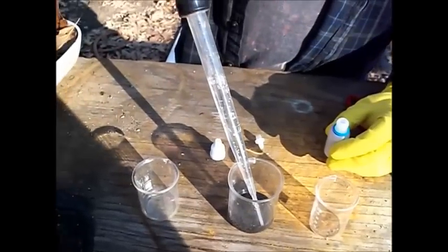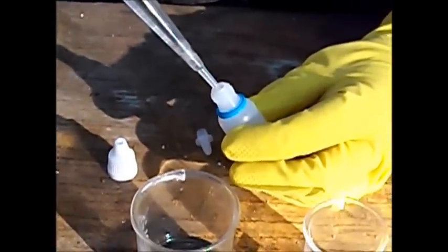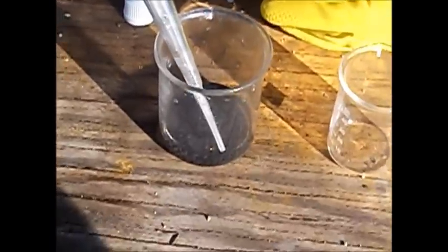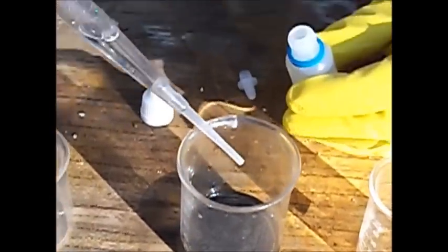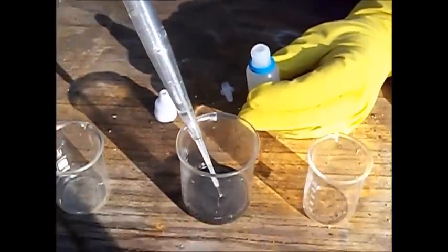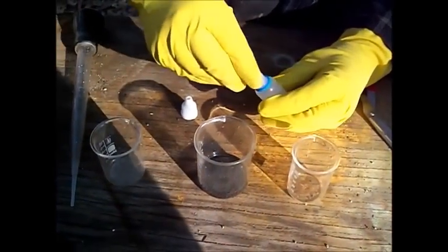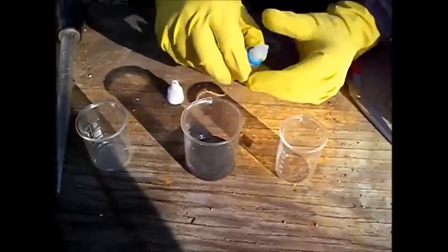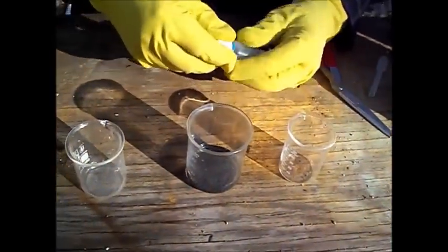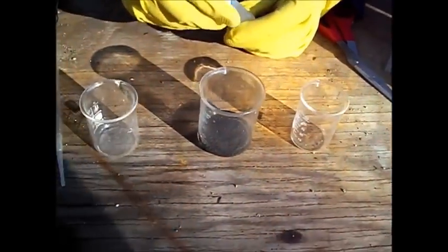We're going to transfer the solution now. I'm going to go ahead and draw it up. Snap that back down, and now you can drip one drop at a time. This bottle will be labeled — I'll put a little piece of paper tape on there. You'll see that in the next part of the video.